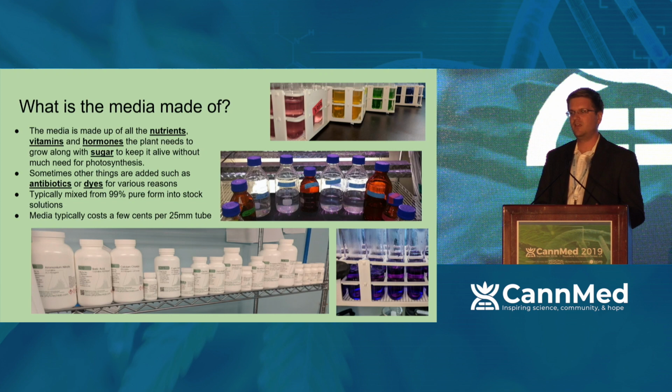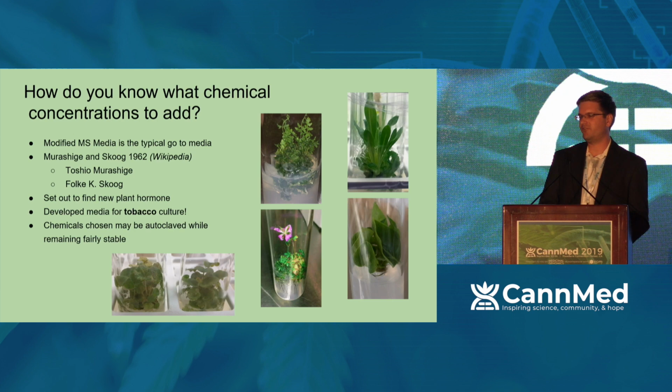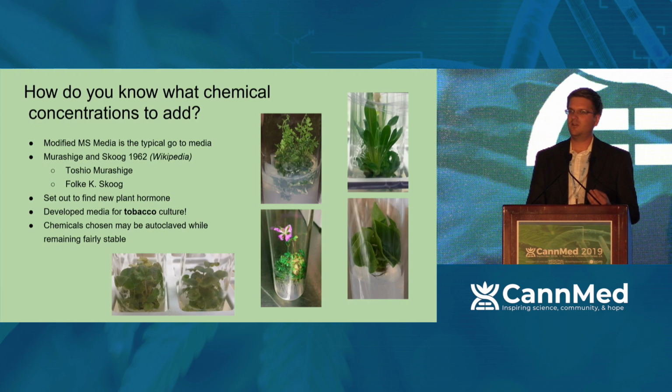So how do you know what chemical concentrations of all these things to add? Apart from the lots of different nutrient companies that have developed this stuff, there is a media called MS Media. It is the standard for pretty much every tissue culture protocol I've seen. There are a couple of modifications for bananas or orchids, but in general, MS Media was developed for tobacco culture, and that is key to talk about here, because cannabis is not tobacco. So when you put cannabis in this media, sometimes these plants are lacking nitrogen, or other hormones that you'd expect, and they're just not there.